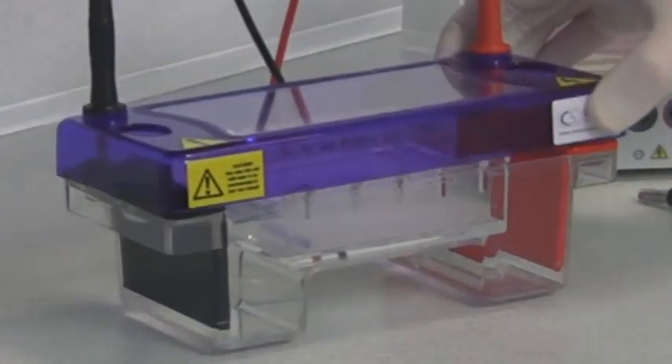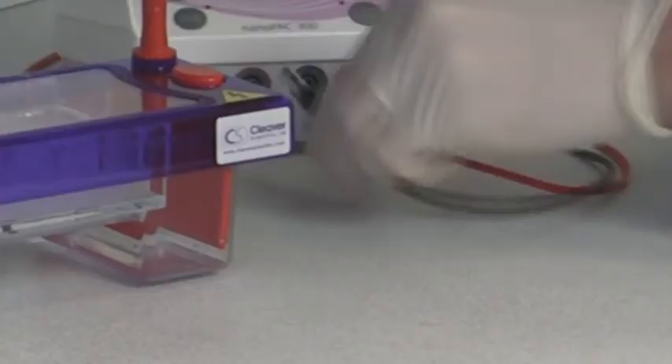Once the samples are loaded, simply replace the asymmetric lid before connecting the tank to the power supply.